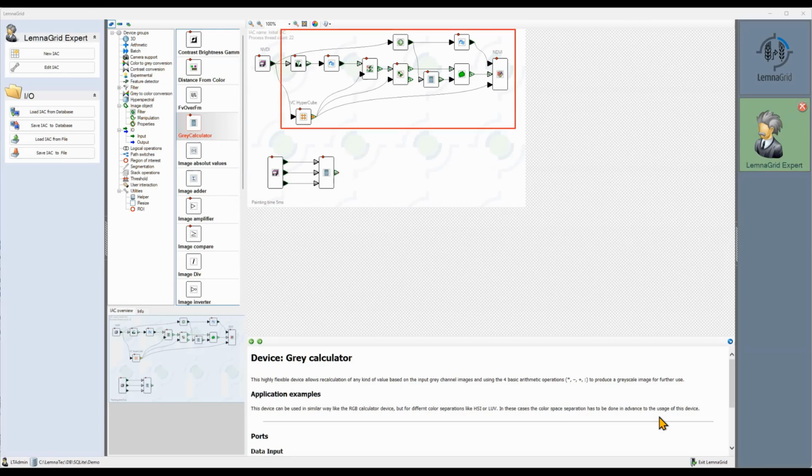We could send this data through the same pipeline as the NDVI above. However, the segmentation would be a bit more difficult than with the NDVI. The border of the plants looks somewhat blurry with this index. Since we have used the same hypercube twice, we can use the segmentation done using the NDVI and add only a writer and a color property device with the values from this calculation.